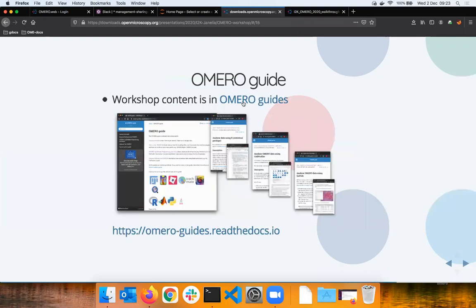The content of this workshop is to be gleaned from the OMERO guides. Okay, so Jean-Marie pinged you the link to the materials here, but ultimately, if you really go through that PDF, it will always point you to some part of these OMERO guides, okay?